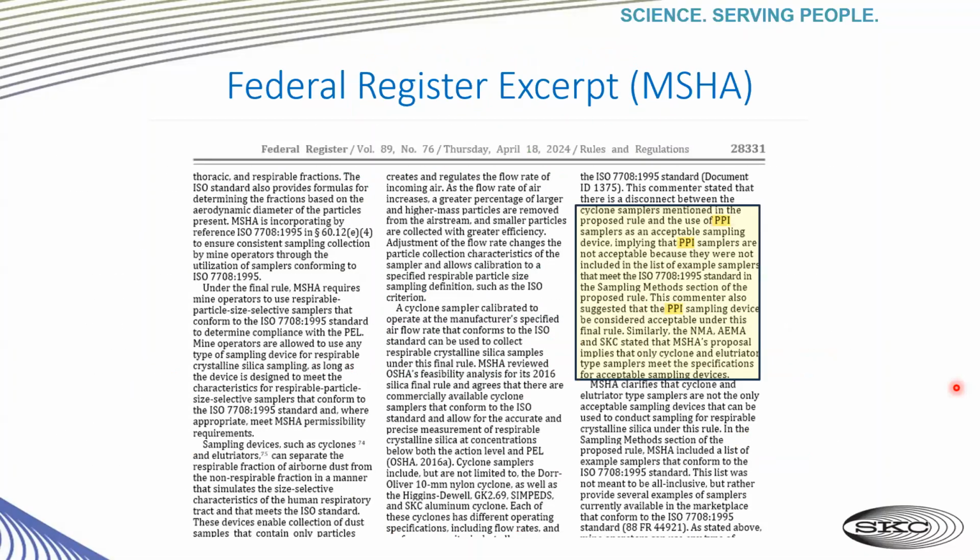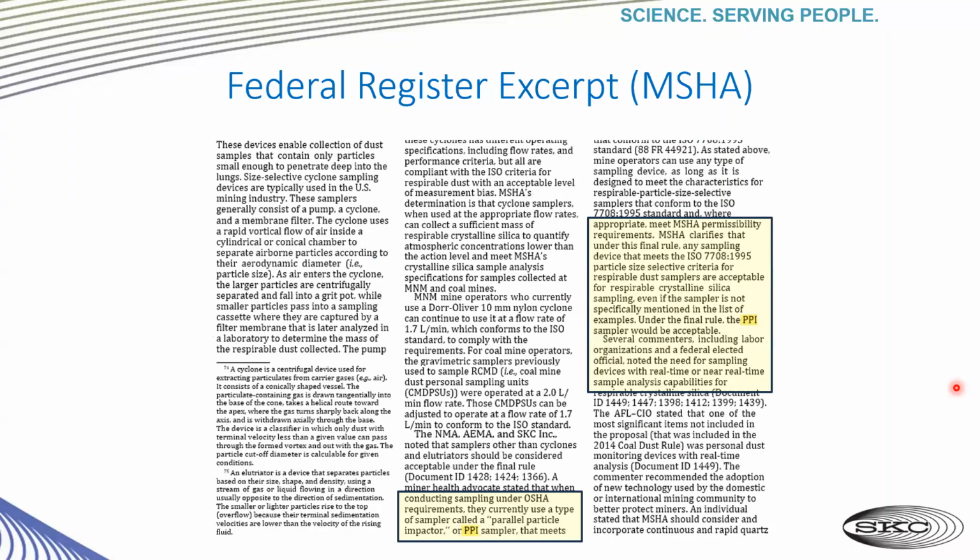And again, if you don't trust me or you want to do your own research, these next two slides are just to highlight where it is stated in the new MSHA silica rule on page 28,331. So here is the first page where it is listed. And then here is another page. And I'll leave that up there for just a second.